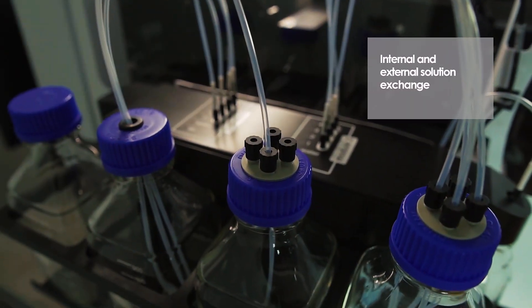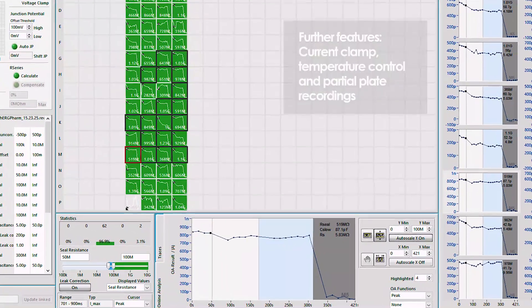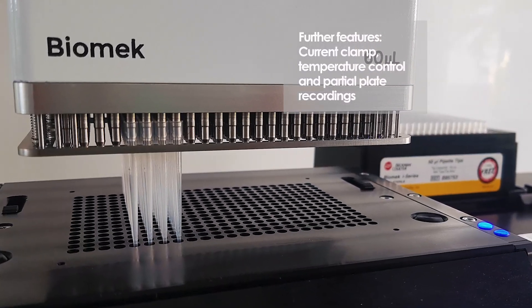Study the most challenging ion channel targets. Profit from multiple features including current clamp, temperature control, and partial plate recordings.